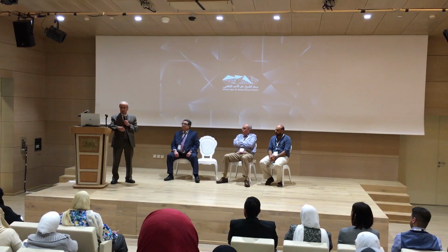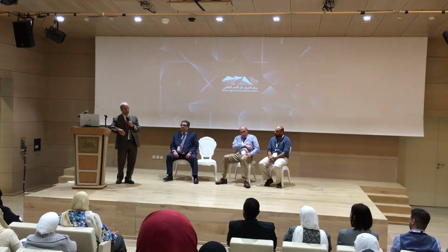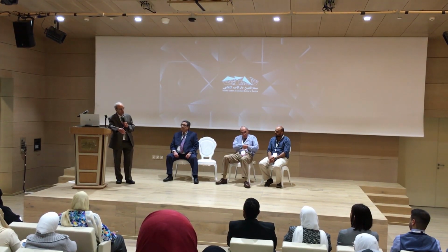I familiarize myself with everything you do in advance. If I need more information, I will call the lab director at the hospital and check with him or her to see what these details are, or what do I need to know more about the laboratory. Once we get acquainted and familiar with the process, then I set a date for the inspection.